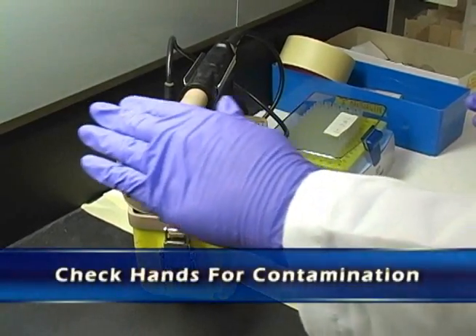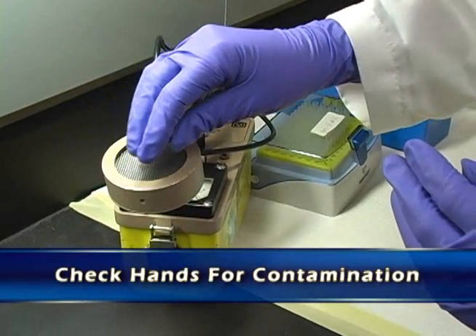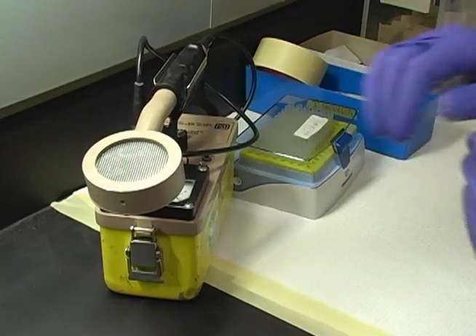Continually check your hands to make sure that they're not contaminated. If there is contamination on the gloves, change the gloves and keep working.